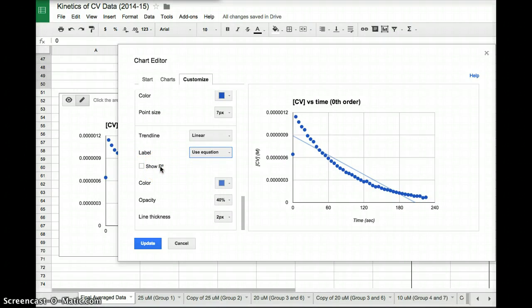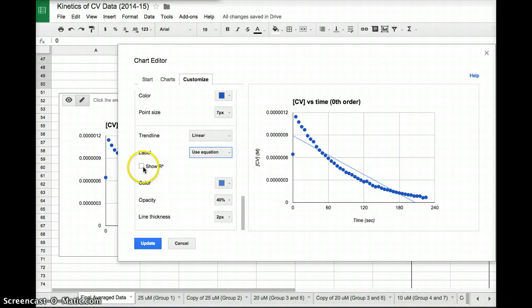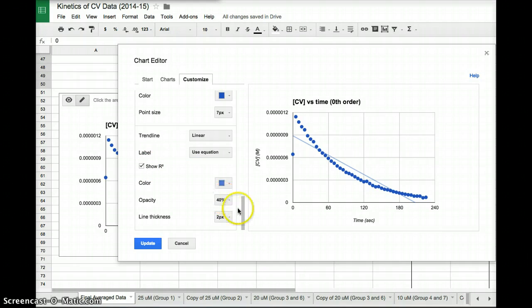What the r squared value does is tells you how close is your data to what you want. So the r squared value, if I check this, I'm going to get a value for the r squared. The r squared number, we want it to be as close to 1 as possible.